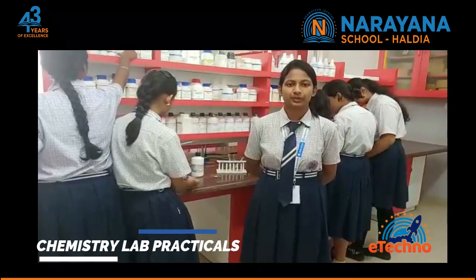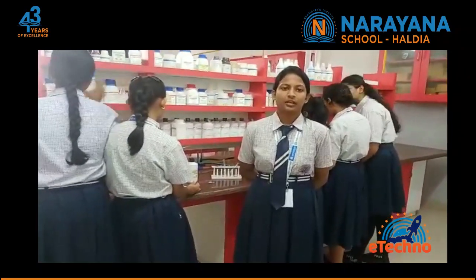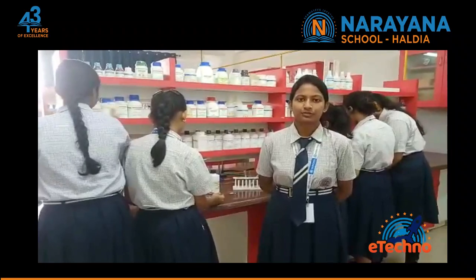Good morning everyone. Today we are doing a practical for identification of organic compounds, and for this test we have to do three steps.